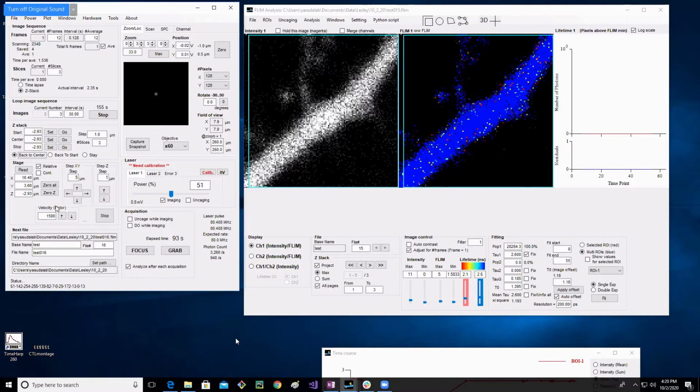So it's not actually super easy, but what we do is we use this motor readout to try to determine how deep we are. I don't know if you guys have been shown that already. No? Okay. So what I do is I hit 0Z, okay?